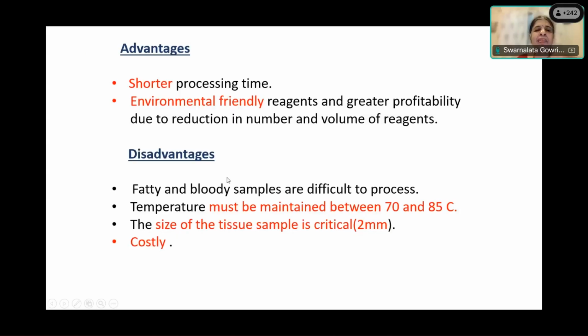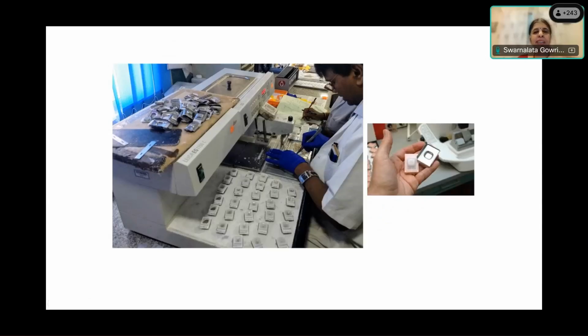And in labs, it's very hard to have one set of processing for one tissue and another set of processing for another tissue. But if you are very environment conscious, microwave tissue processor is something you could standardize, but you need to work at it to get good sections. So having processed, we come to embedding.